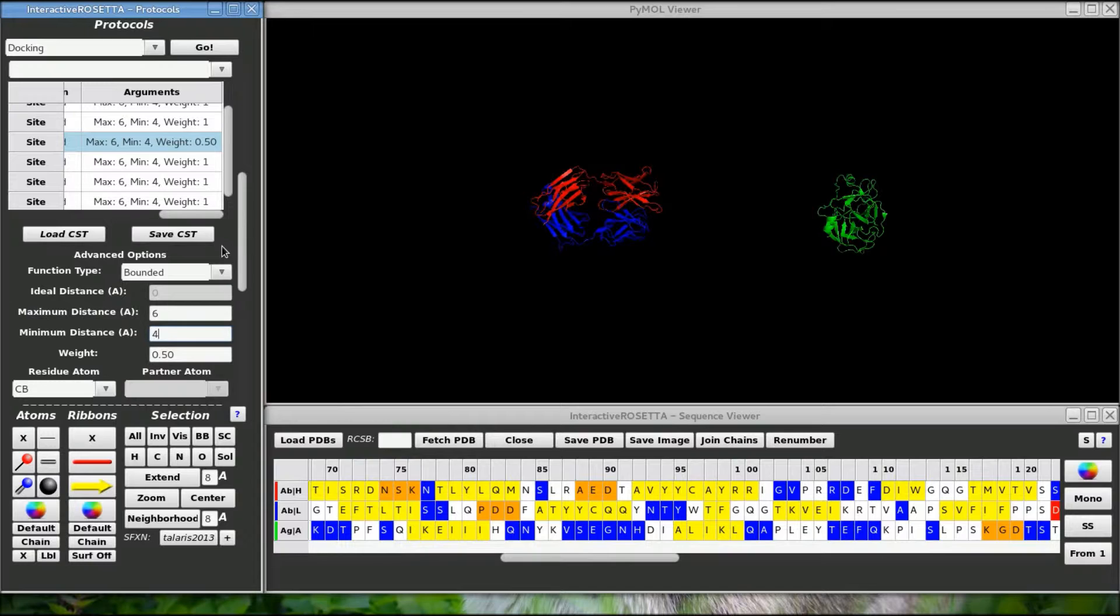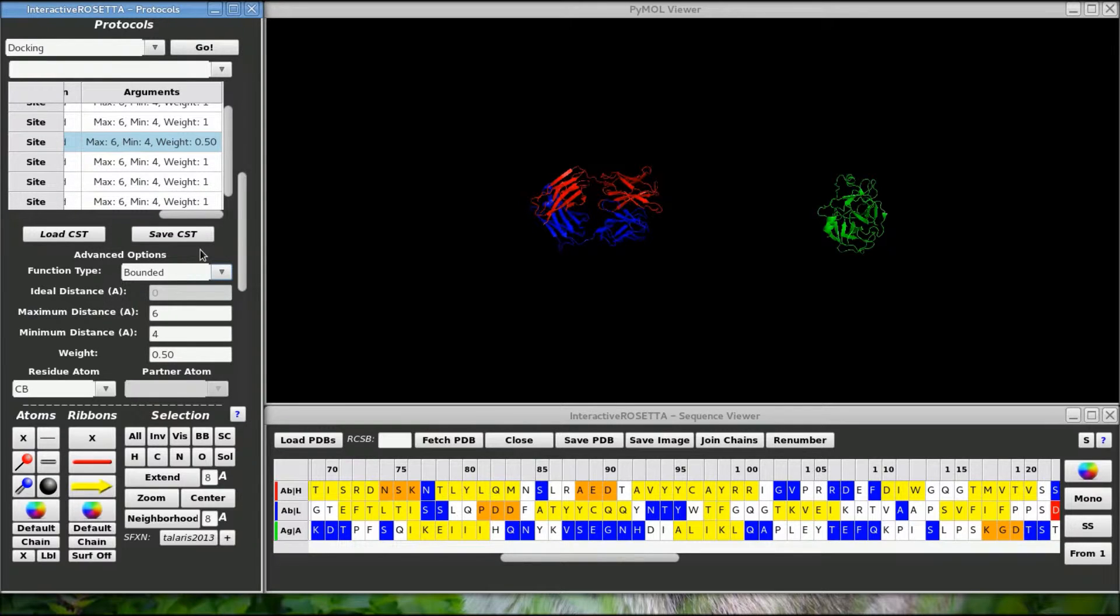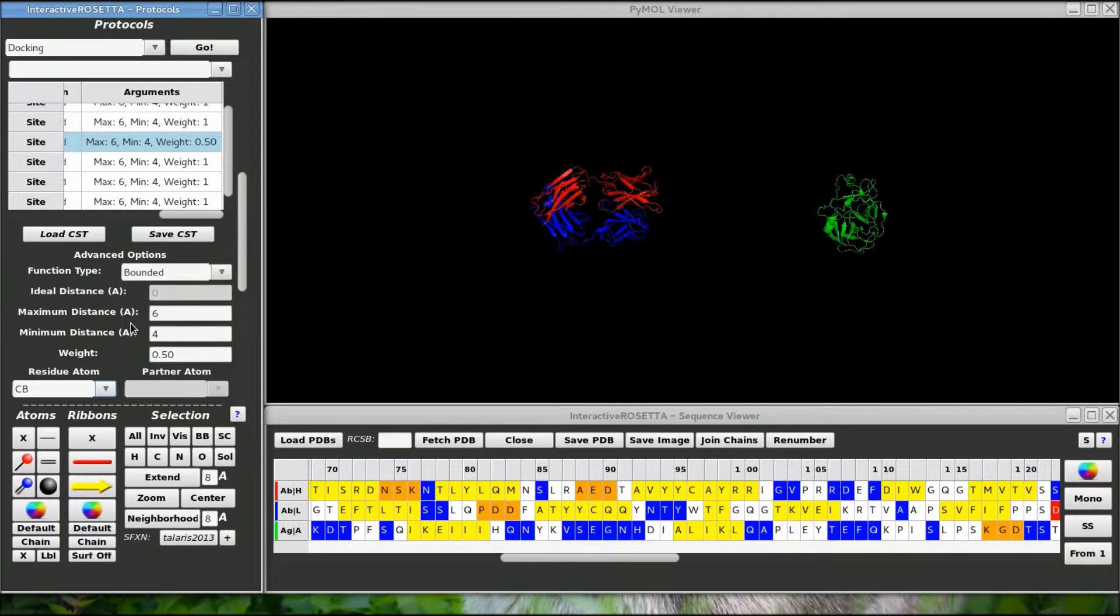There are also a lot of other advanced options here. Unless you know what you are doing I would not change the function type. The min and max values specify the range in angstroms between the two partners in which there is no penalty, otherwise a parabolic penalty is applied outside of this range. You can also change what atoms are constrained in the selected residues, but the default of the C beta or C alpha for glycine should be okay the way they are.